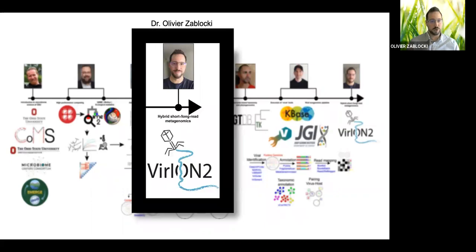As of today, we will be talking about hybrid short and long read metagenomics that we have developed as part of our VirION2 pipeline, which I will be talking about more shortly.